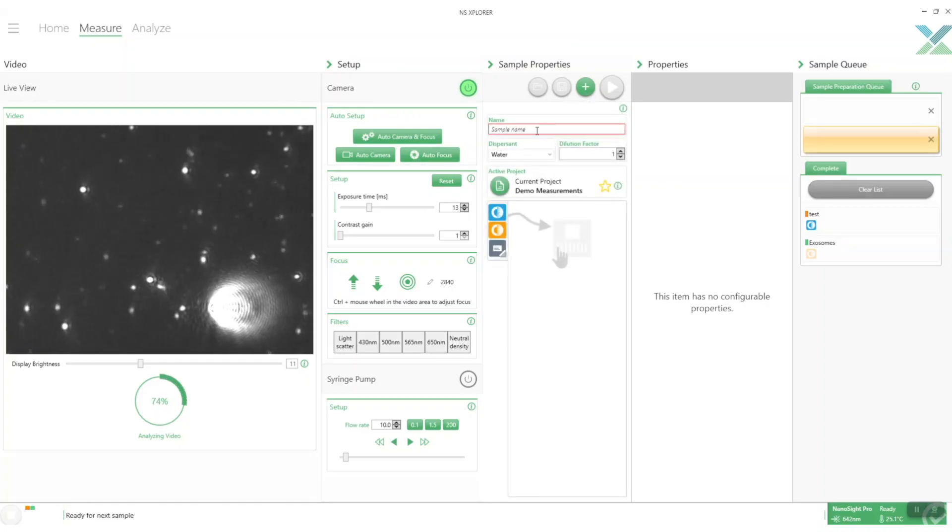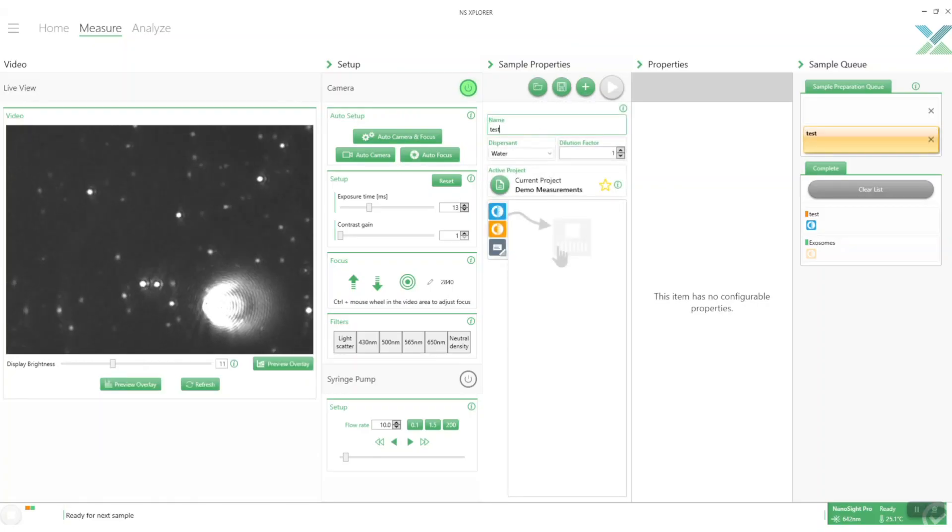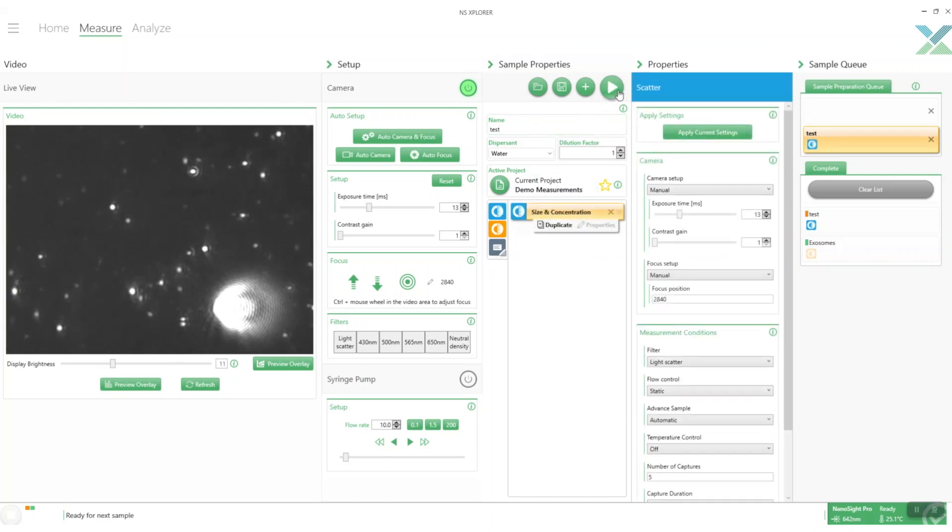Create a new sample and just run a scatter measurement this time so we just apply our current settings and click go.